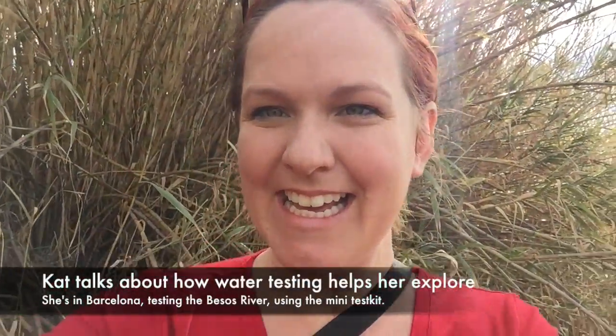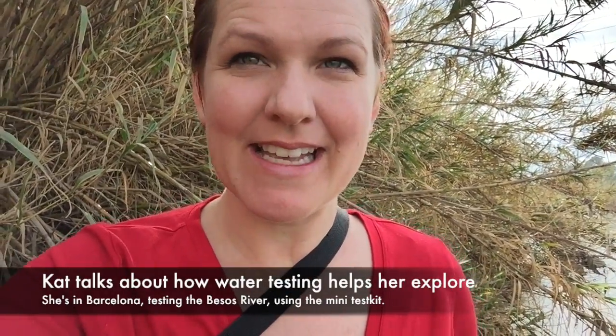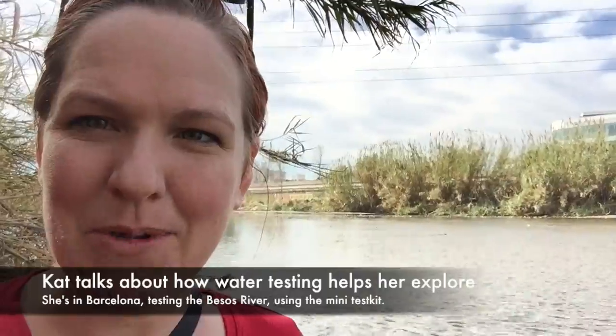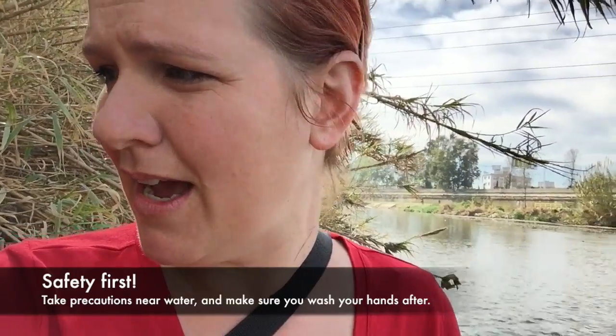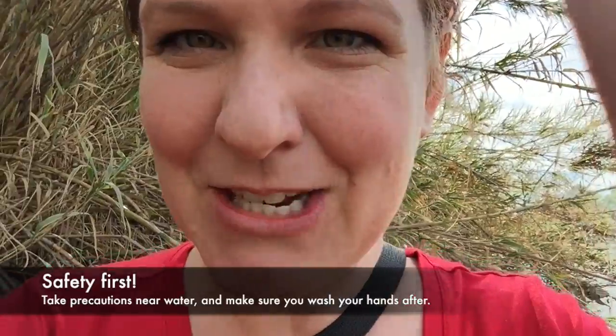I'm here in Spain and one of the best things about Water Rangers for me is that I get to see new areas and new bodies of water. Today I'm at the Besos, a beautiful little river that flows into the Mediterranean Sea. You can see we've got quite a lot of garbage. I usually bring a garbage bag to pick up garbage but I didn't have any gloves, just my little mini kit with me today. I'm going to show you what I'm doing for my test and how you can incorporate citizen science into discovering new spaces.